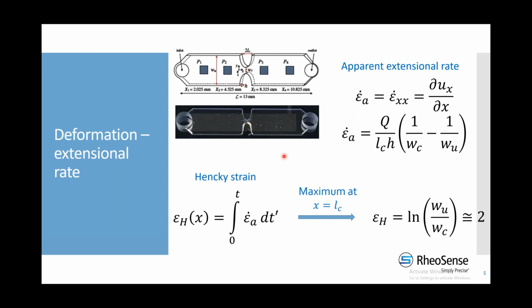So that was sort of the background on the practical and real-world applications of extensional viscosity, and now I'm going to talk to you a little bit about our technology that we use for measuring extensional viscosity. Our flow channel is a combination of microfluidic and MEMS technology. This schematic shows the dimensions of the channel, and this is an image of the channel.